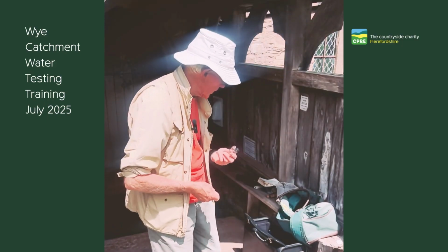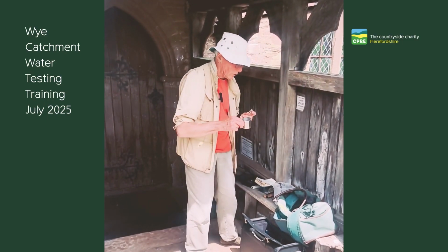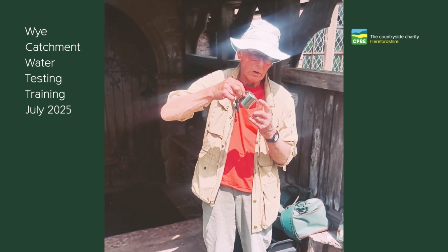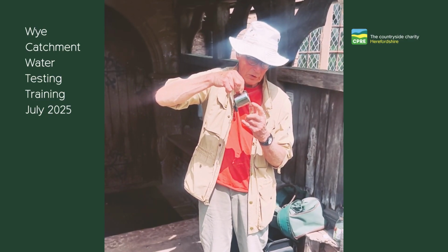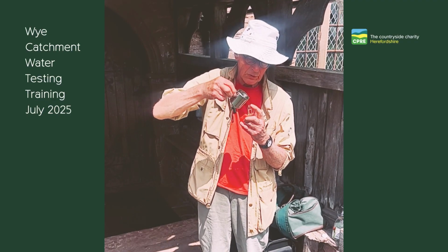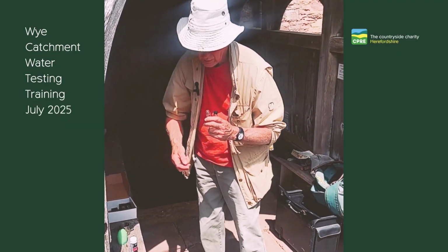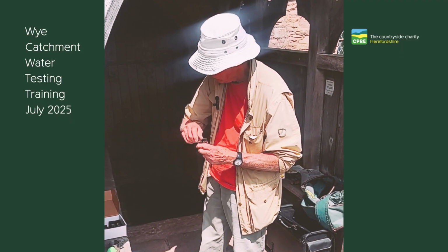So the first task in this test is to fill 2 cuvettes with your sample, which can be done from a small jug like this, or some people find it easier to use a syringe, but the little jug is fine.